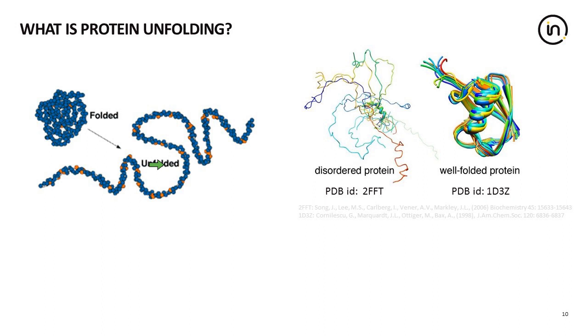It is also important to note that even minor conformational changes in certain parts of the protein can destabilize the entire structure. Now, if you look at the figure on the right here, disordered protein. This is put in here to further emphasize the complexity of protein folding and unfolding, because there are proteins that are intrinsically disordered and can only form a higher order structure when they come in contact with a ligand or a target molecule.